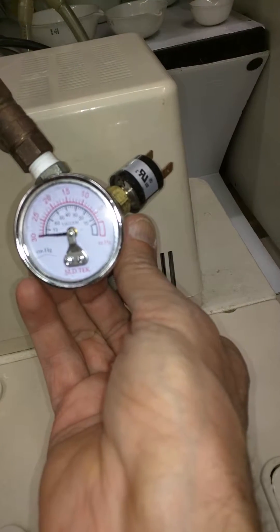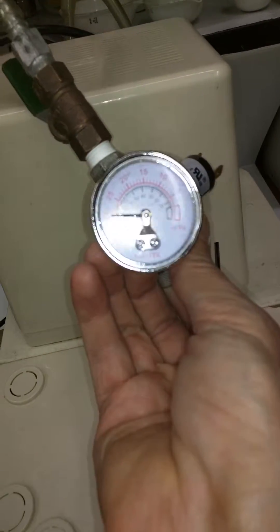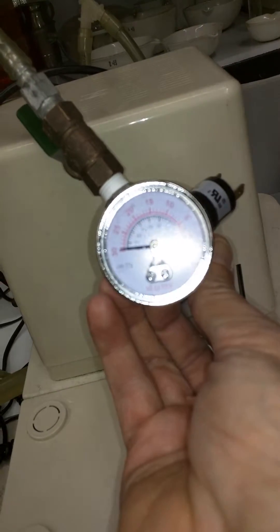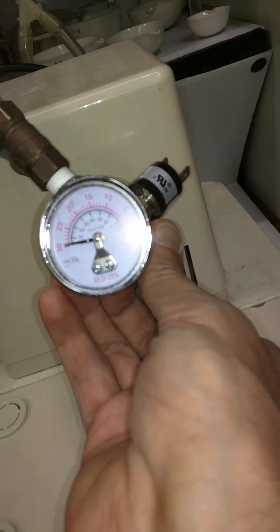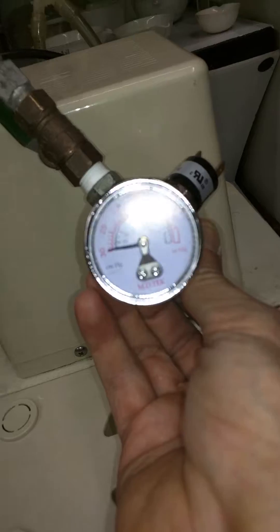Obviously, it's not good enough for spectrometers. But for anything else, for any applications and distilling, it should be great.